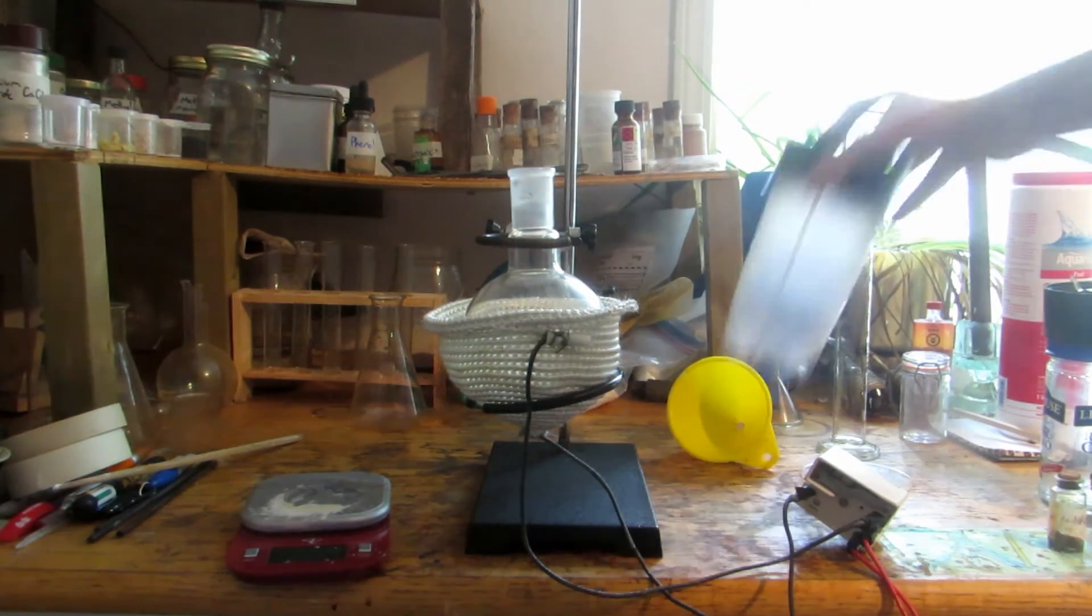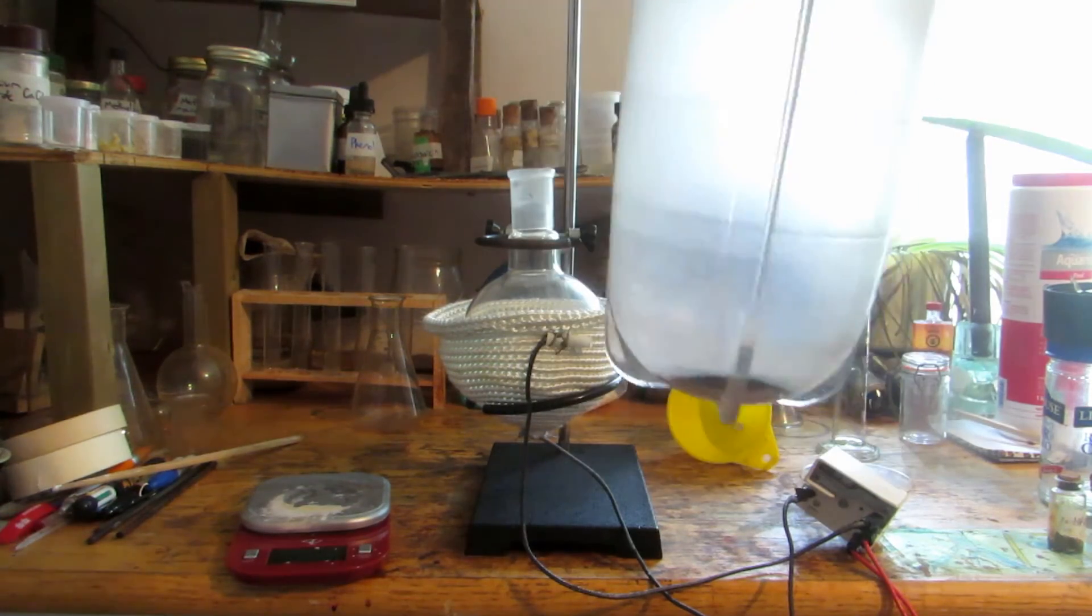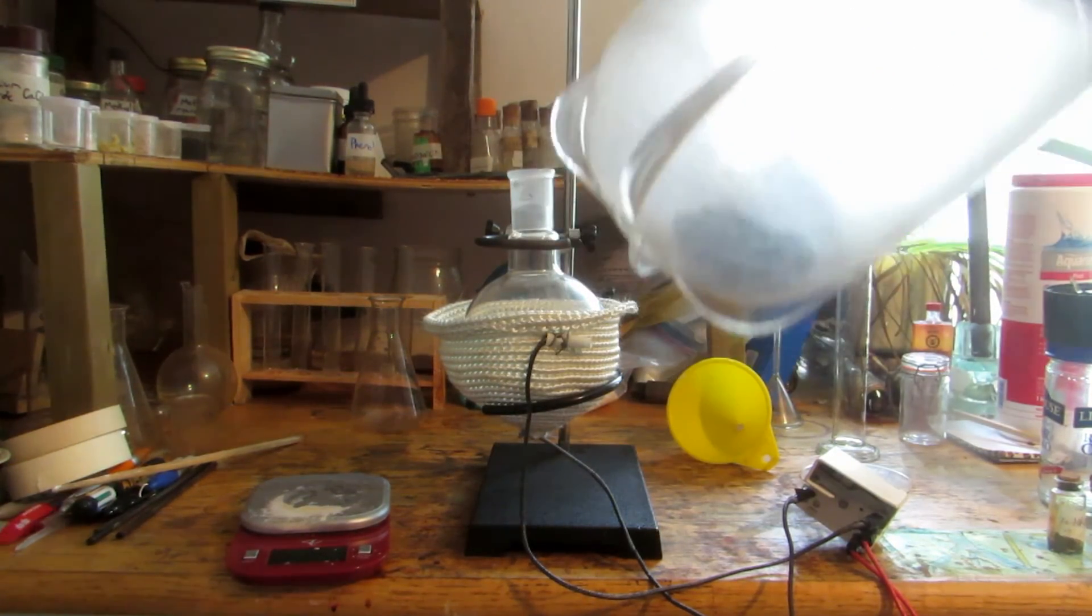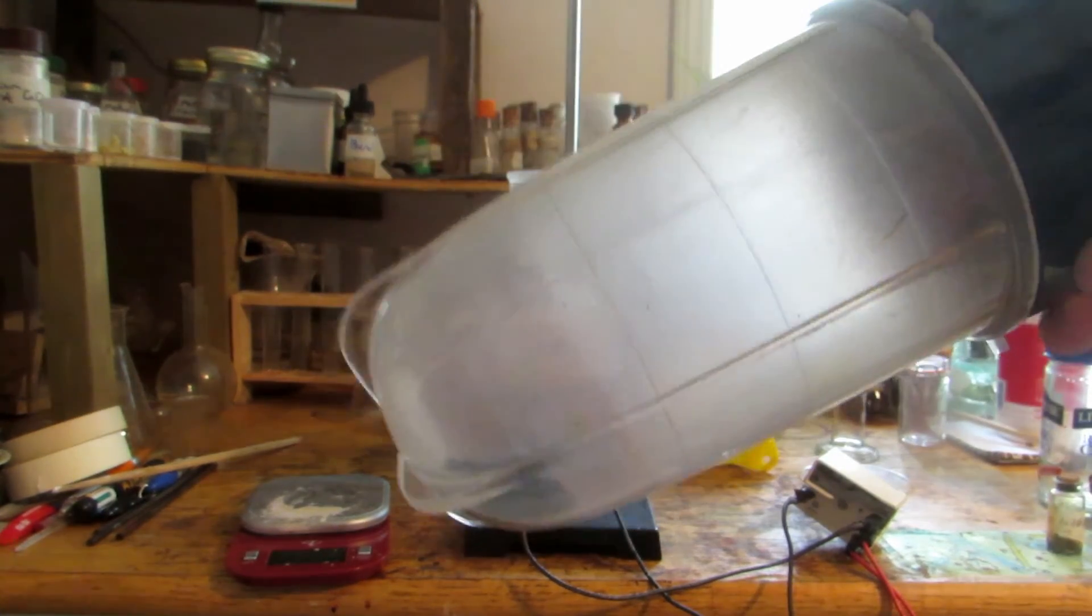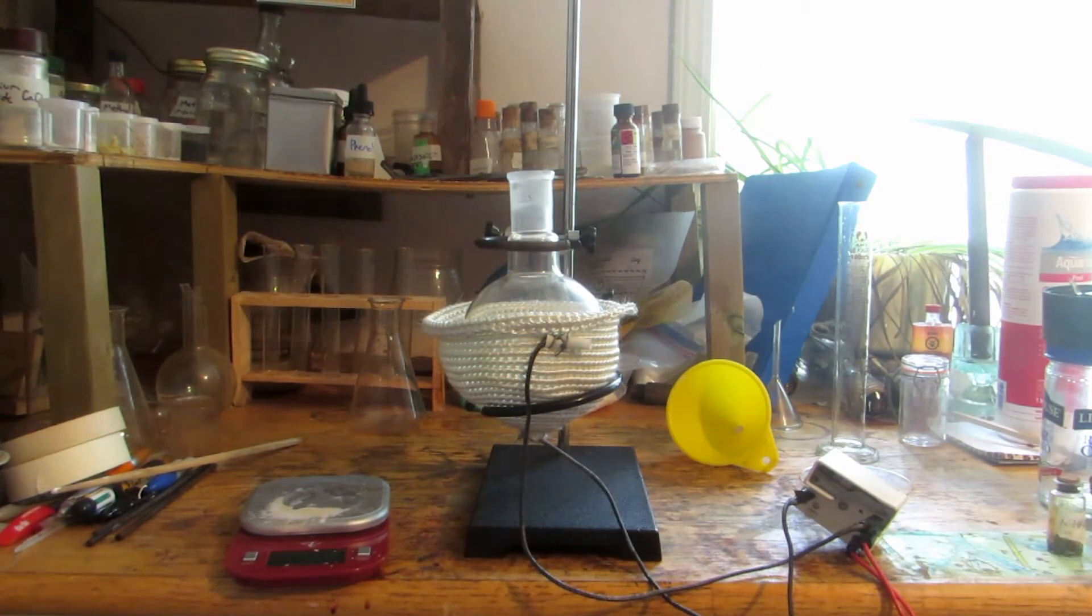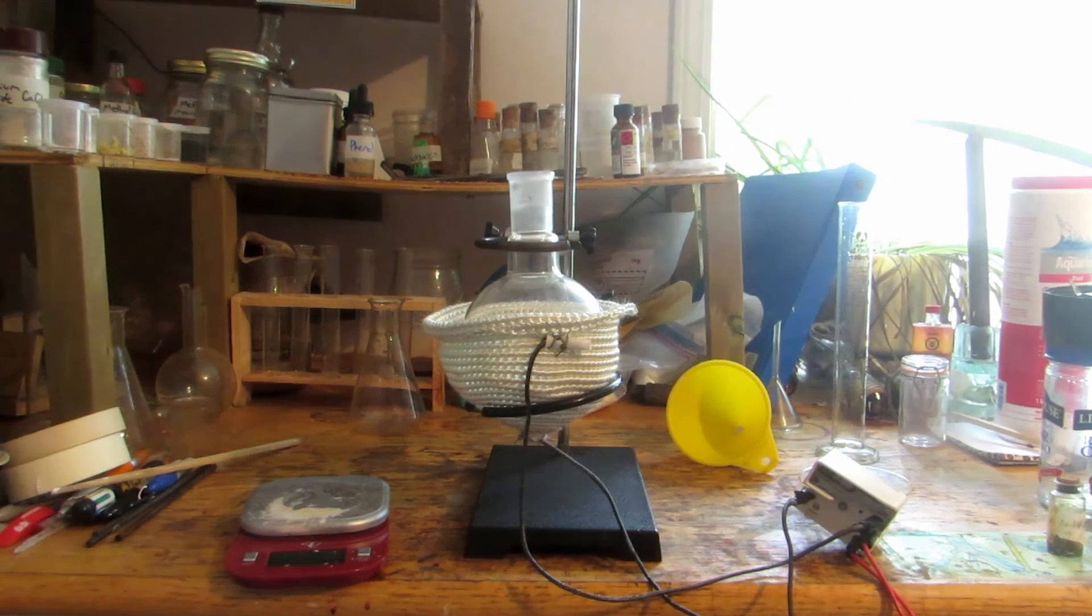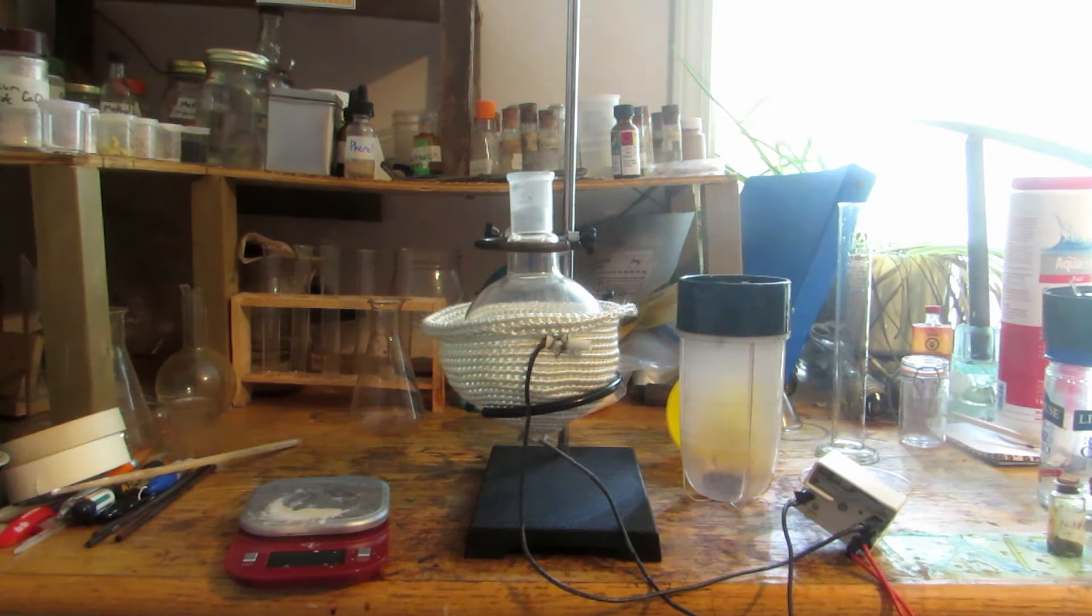I weighed out 5 grams of elemental iodine and crushed it in this magic bullet so it's in a nice fine powdery state now. The camera doesn't pick it up, but it looks a bit purple due to it slowly sublimating at room temperature. If you give a gentle sniff, you can detect the chlorine-like odor of iodine. We can now begin slowly adding this to the solution.